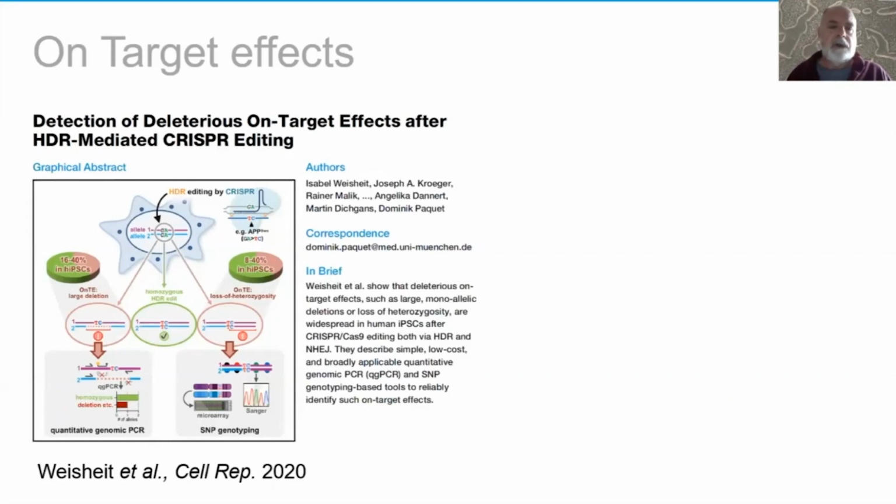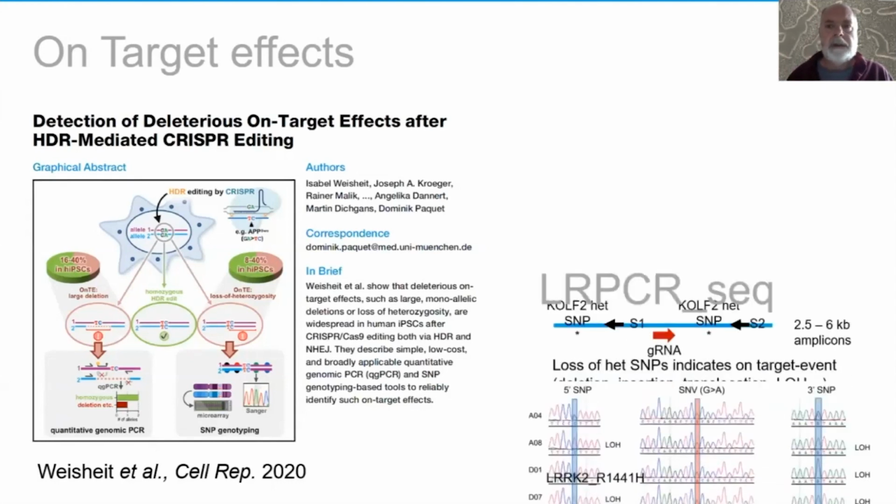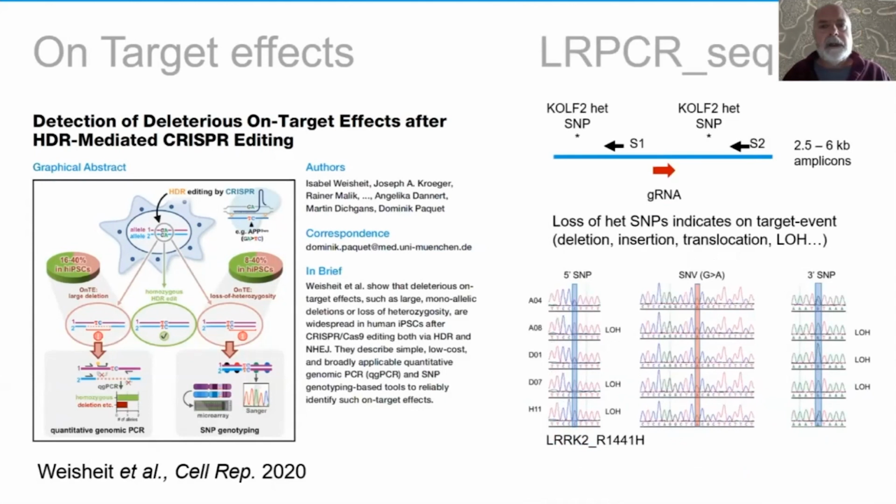So in cases where you think you have a homozygous clone, you might actually have what is known as a hemizygous situation, where you have one copy of the gene intact and the other copy is lost. And so we wanted to be sure that when we are looking at a homozygous modification, and that could either be the homozygous SNV over SNV clones, or the revertants, which is a wild type over wild type clone, we have both copies of the gene present.